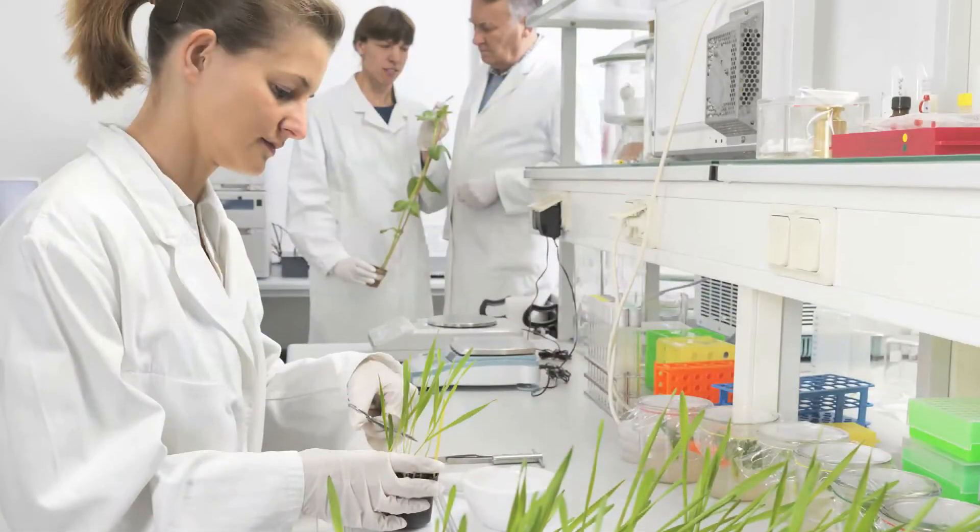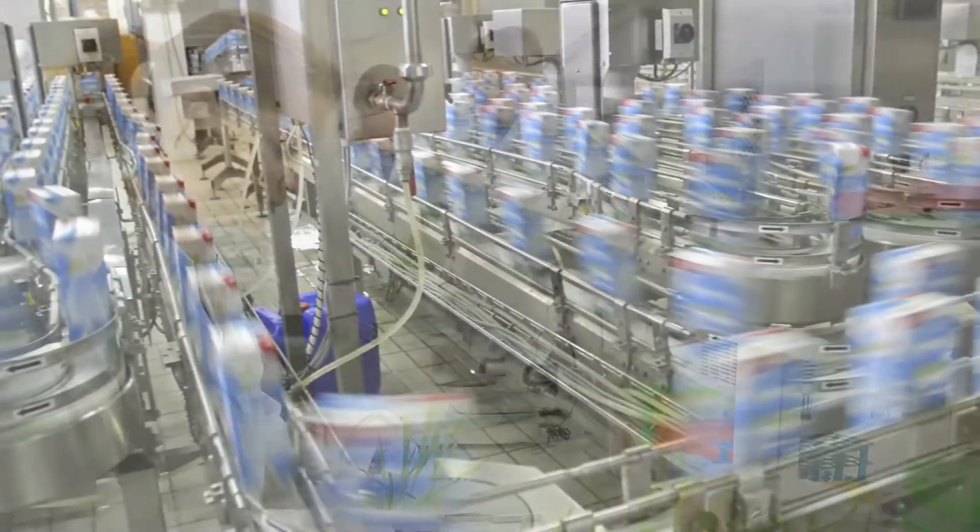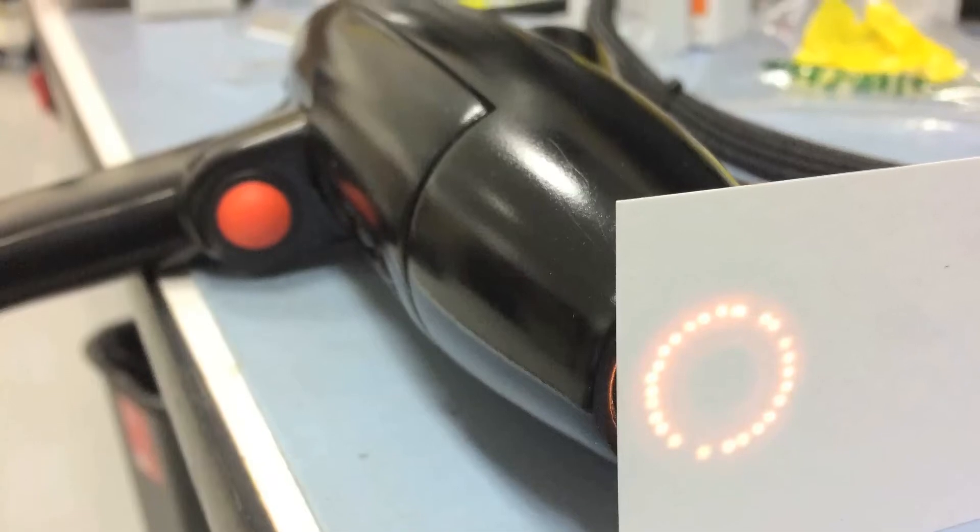Whether you are a researcher in a lab, working on a production line, or looking to integrate a small NIR spectrometer into a handheld product, the FlameEar can be uniquely configured to suit your exact application needs.